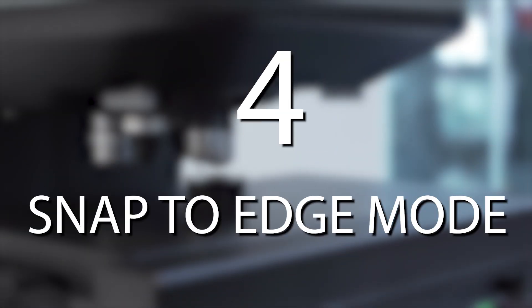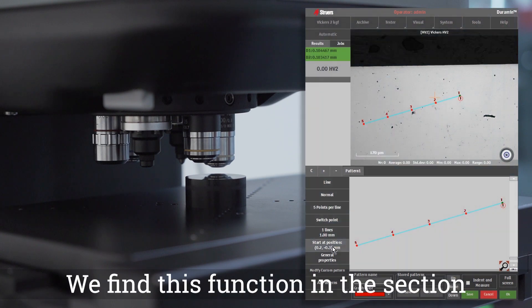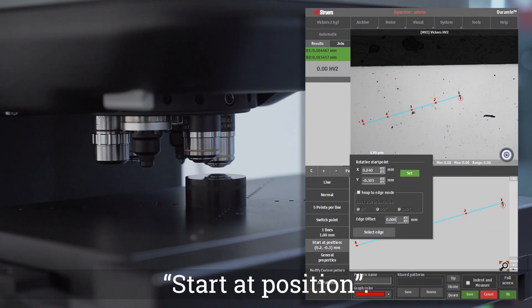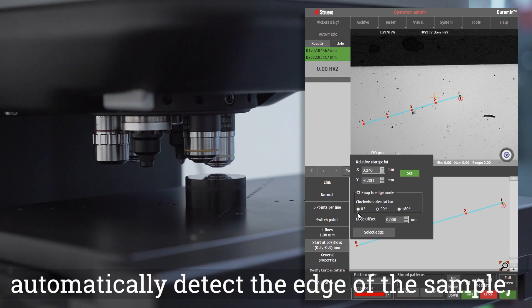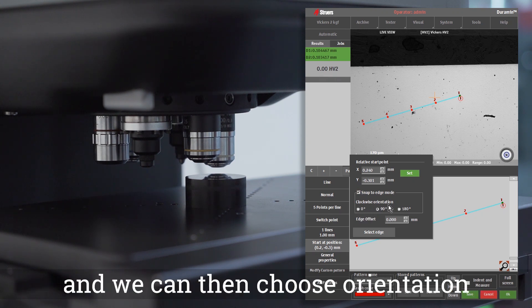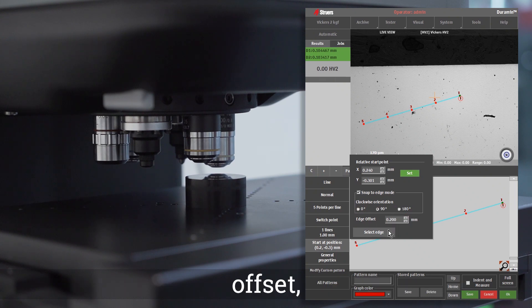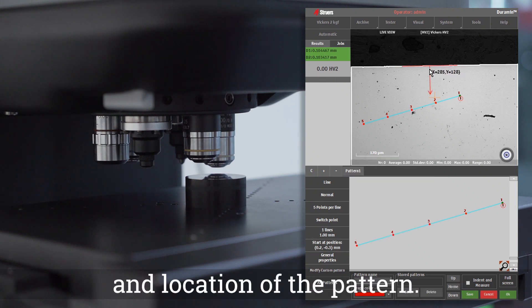Snap to Edge Mode. We find this function in the section Start at Position. If it's enabled, the software will automatically detect the edge of the sample and we can then choose orientation, offset and location of the pattern.